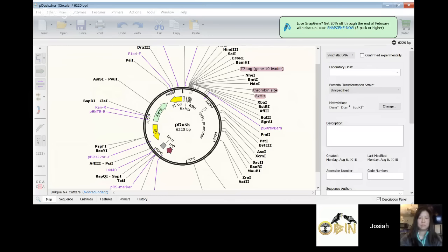You can't find AddGene? So when you open up SnapGene, the initial thing, you should click on import, and there should be a drop-down on the import button, and you should go to AddGene plasmids. Thank you, Matt. Appreciate it.